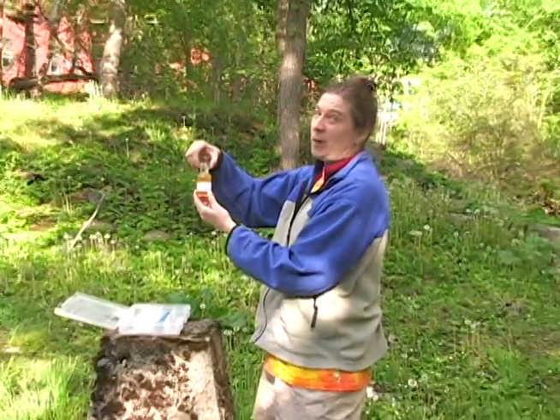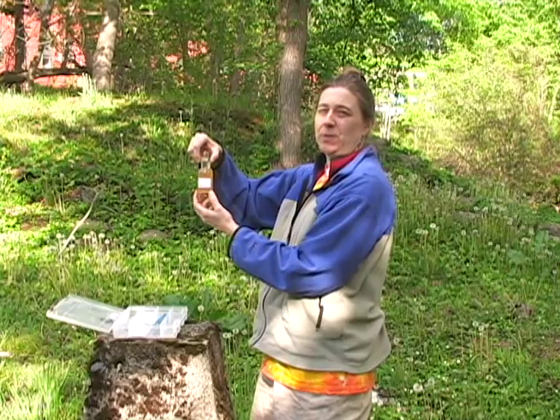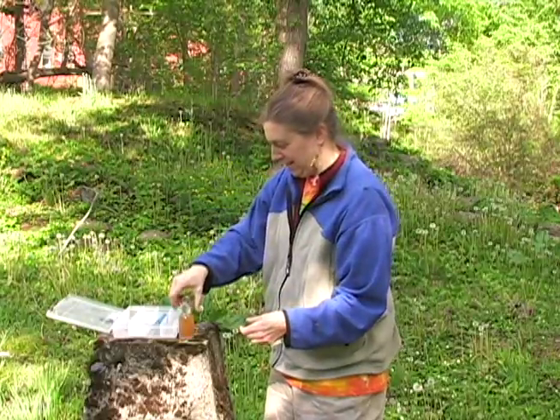Bubbles — which is a no-no. No air bubbles. If you do get air bubbles in the bottle, you have to dump the sample and take it again. And I've got air bubbles. Okay, sorry. Let's try the second one.